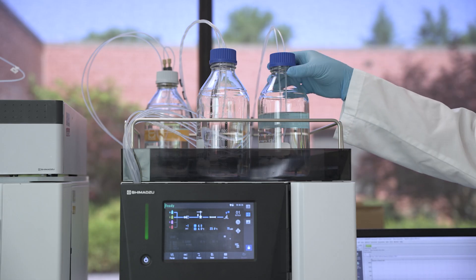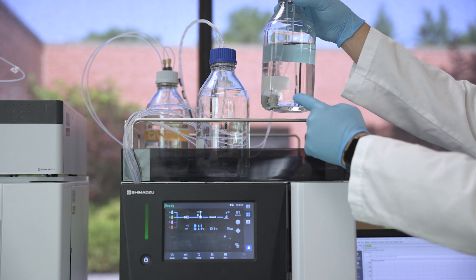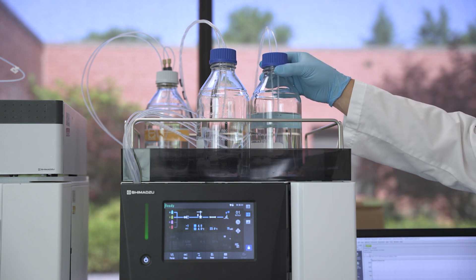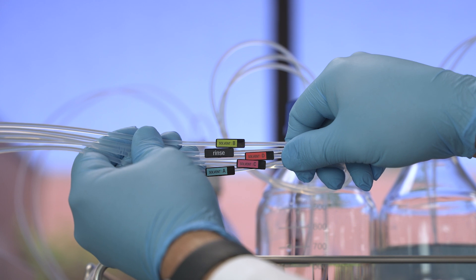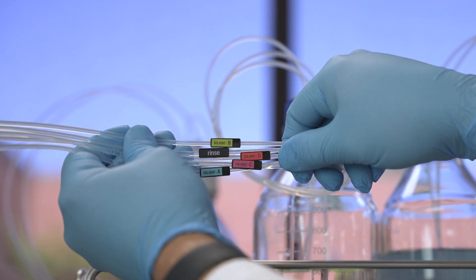Make sure that you have sufficient mobile phase for each solvent line and the suction filters are fully immersed in the solution. The I-Series have four lines labeled A, B, C, and D for mobile phase bottles.